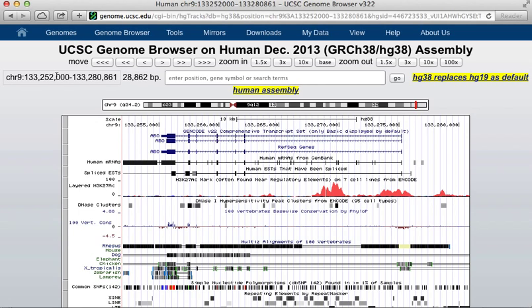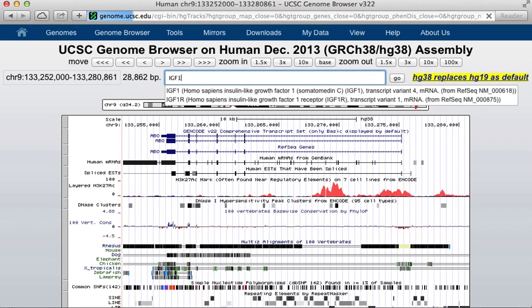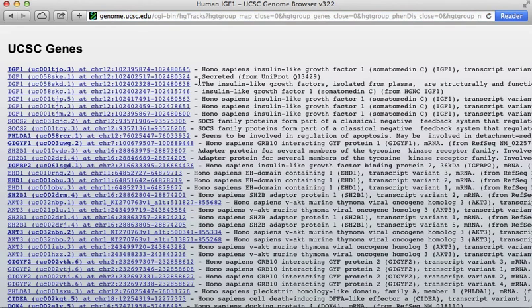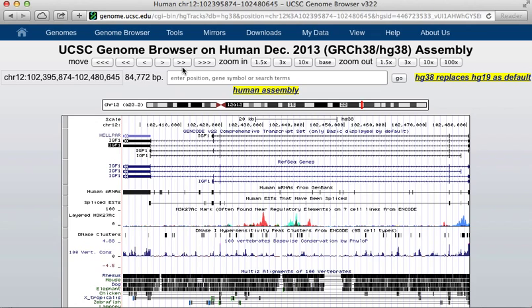By default, it's taken us to a position on chromosome 9, but right away you have this search bar where you can enter different chromosome positions or gene names. As an example, I'm going to use a gene called IGF1, and if I enter that and say search, it tells me everything it knows that relates in any way to IGF1, but the top hit is what I was looking for — this insulin-like growth factor. I can click on that, and it takes me to the IGF1 gene in the genome.